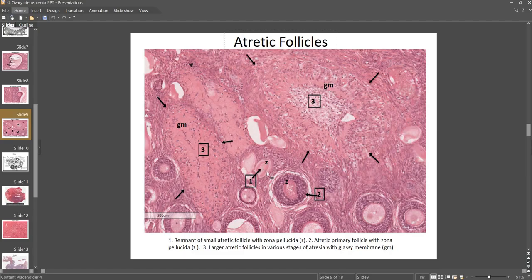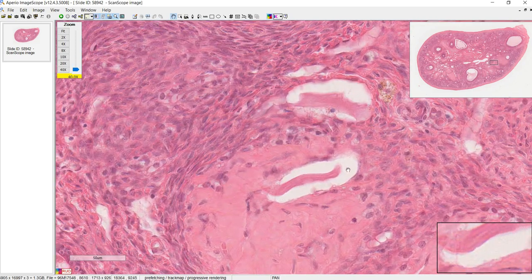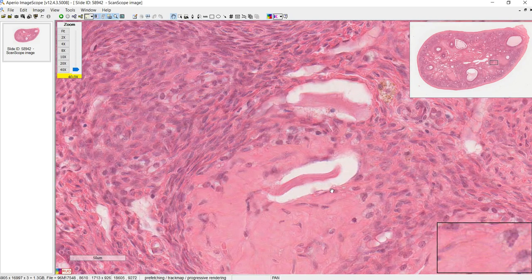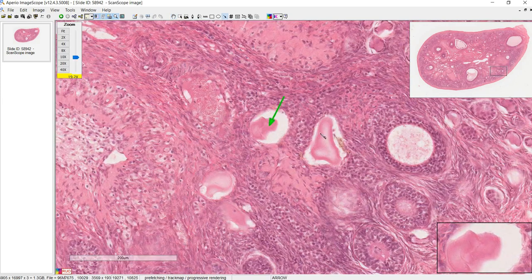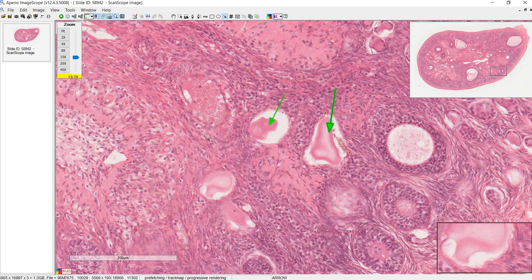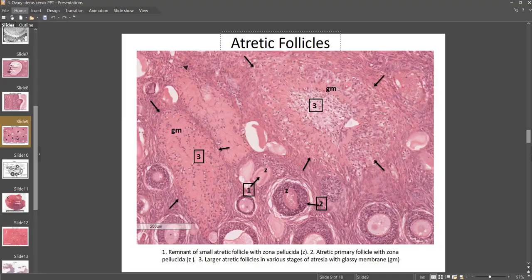Another way to identify atretic follicles is if you see a zona pellucida that's folding in on itself, or if it's alone without any granulosa cells around it. Here you can see a piece of the zona pellucida degenerating inside an atretic follicle. Here are more examples of atretic follicles — this area might also be glassy membrane. Be careful not to mix up atretic follicles with the corpus albicans.